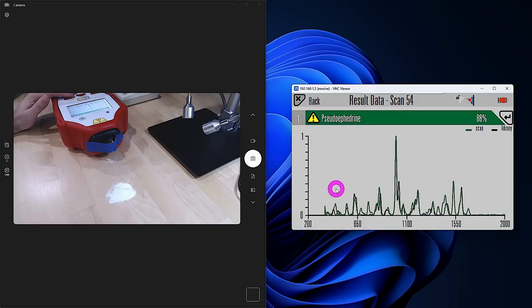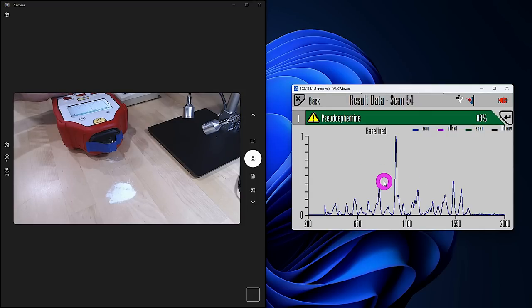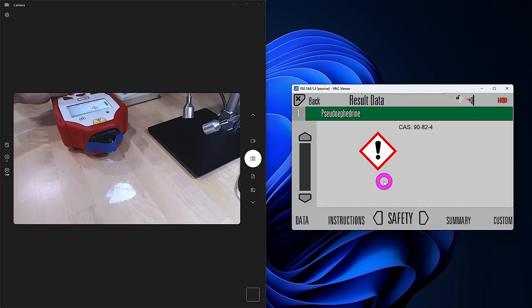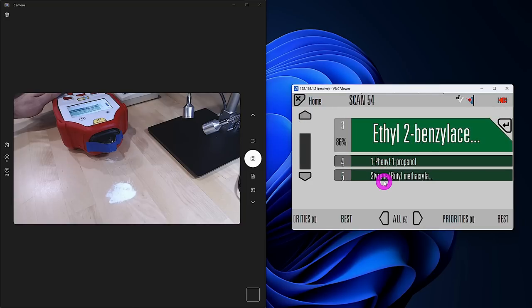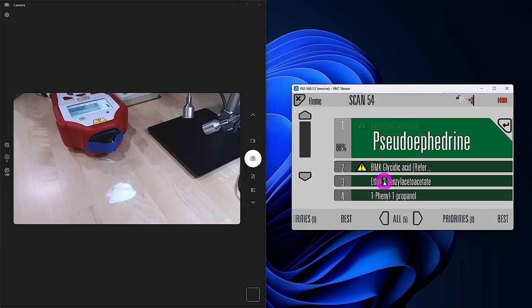It is pseudoephedrine — and it tells us that pseudoephedrine is a controlled substance — with 88% confidence. Selecting the top match shows the signal versus the library is a very close match. This sample isn't pure pseudoephedrine; there are other things in it. We can see the raw measurement and get all the information about pseudoephedrine: what it is, where it comes from, instructions on handling, why it is a controlled substance, safety measures, and so on — very useful if you know nothing about the material. Why do I have pseudoephedrine powder? It's actually just allergy medication. That's one of the reasons it works, and where I live you do need a driver's license to purchase it as it is a controlled substance.